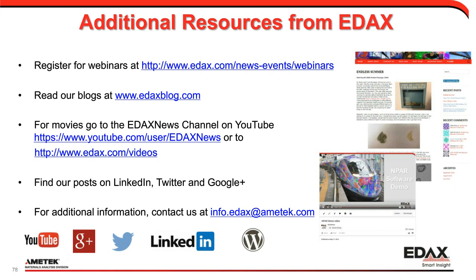Okay, so for our final question live: if we do TKD, which background correction is suitable or ideal? In general, it's usually best to use a combination of dynamic backgrounds and sometimes static backgrounds for TKD. Now, what I've been doing recently with TKD depends on what I'm doing. If I'm doing a single phase material or a single crystal material for TKD, this doesn't really work.